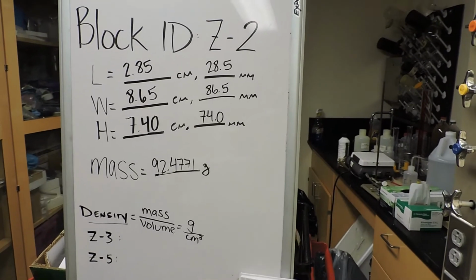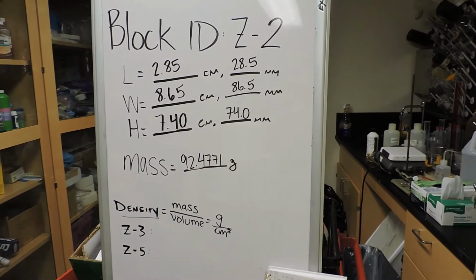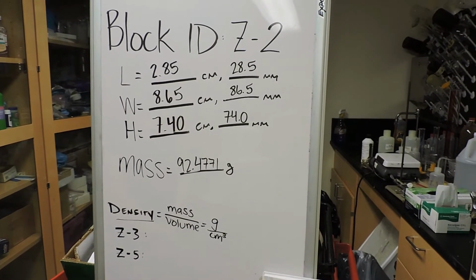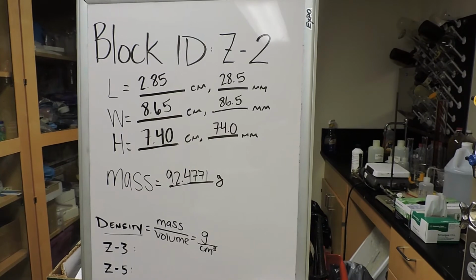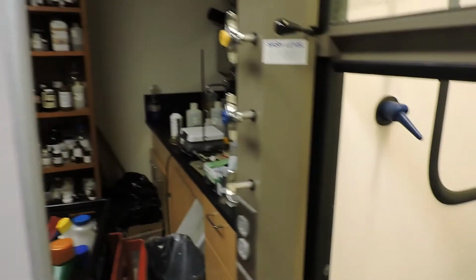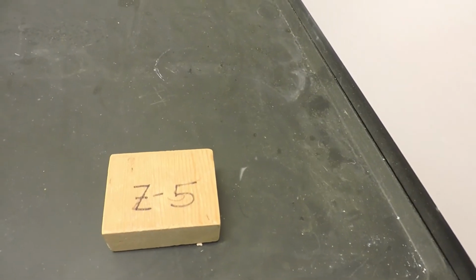Take note that density is a characteristic property of a substance and can often be used for identification purposes. Samples of a given kind of wood have similar densities. These densities differ from the densities of other kinds of wood, and your objective is to compare densities of several types of wood and try to identify an unknown sample of wood.